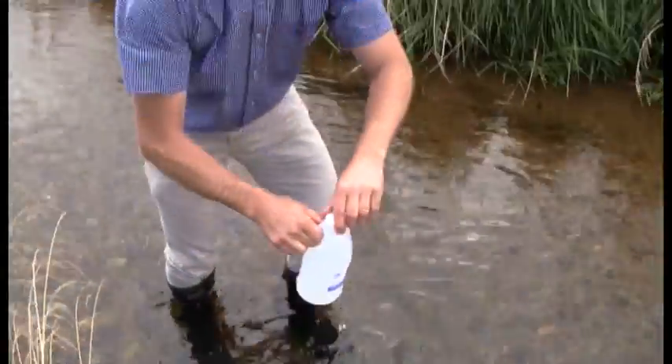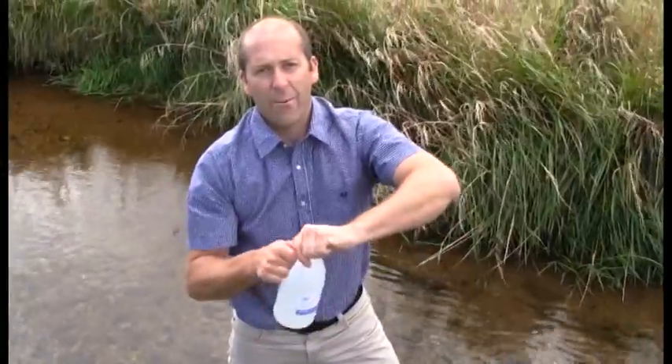Once it's full to the top, take it out of the water and cap it tightly ready to go to the laboratory.